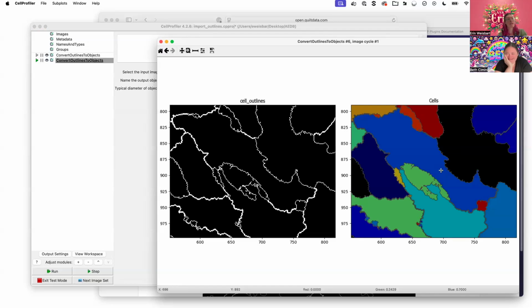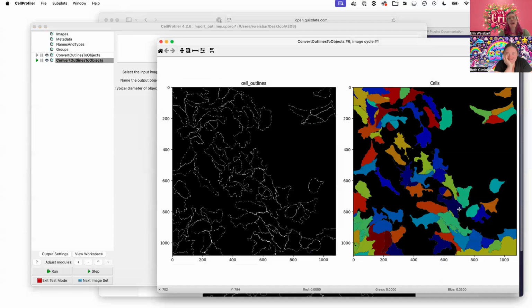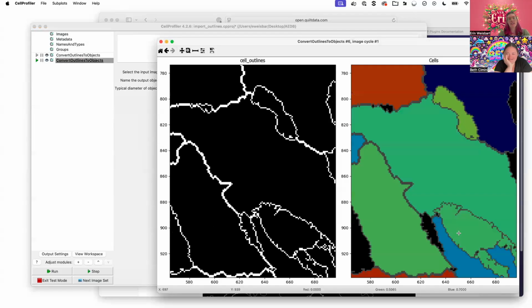And there we go. This is what I was expecting to show here. It thinks all these tiny regions are cells. It thinks these little gaps, these tiny blank pixels in between, are cells, and that we don't want. If you input a number instead of a letter, it will be fixed. Live demos, right? That is why I had set the typical object diameter minimum to 20, and then it nicely sees that these tiny little bits in between are not actually cells and doesn't identify them.